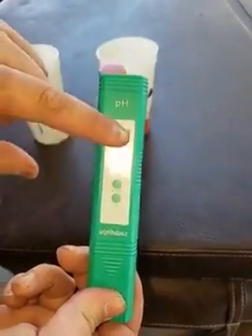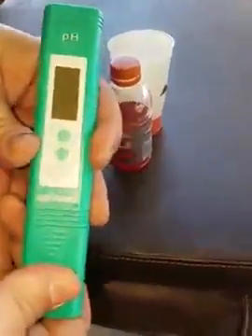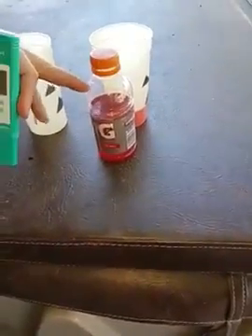So, looking at it, here's your meter. You're going to have your little display right here. It's going to pop up some numbers. You have your on and off and your calibration button. And then, of course, you have your electrode down here. So we're going to first start off with the Gatorade.